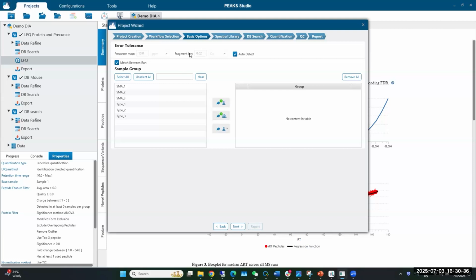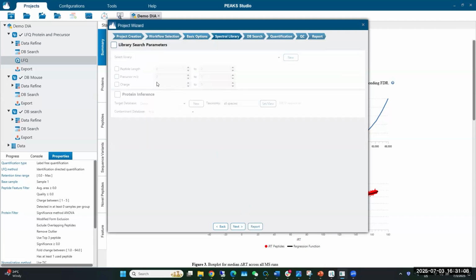To do this, now in this release it is group based. So those are diseased, and this is one group. This is another group. See, now the match between runs is performed on those two groups. After this, we now have auto detect for precursor and fragment ion mass setting. You just keep it as default. And then we can do search.